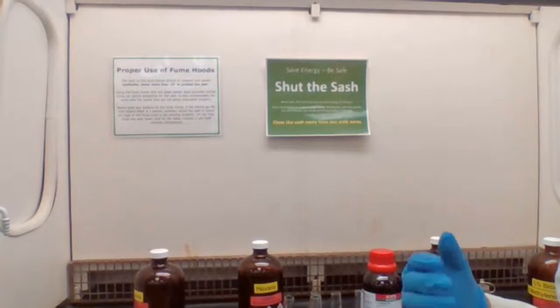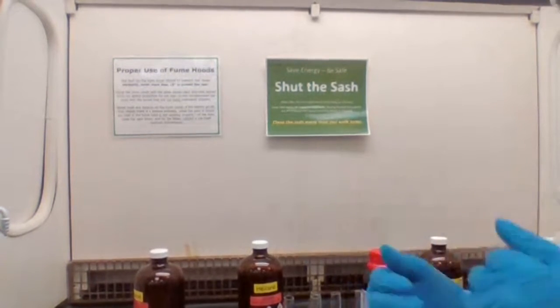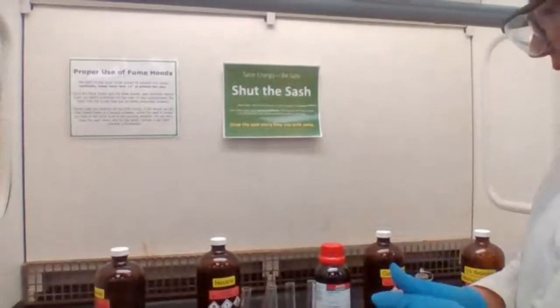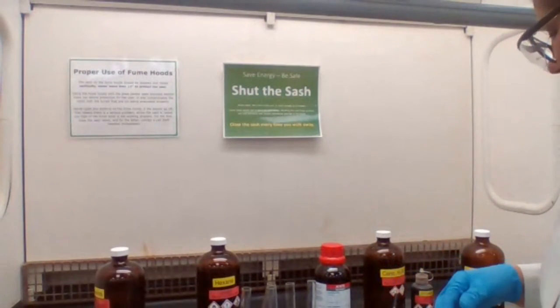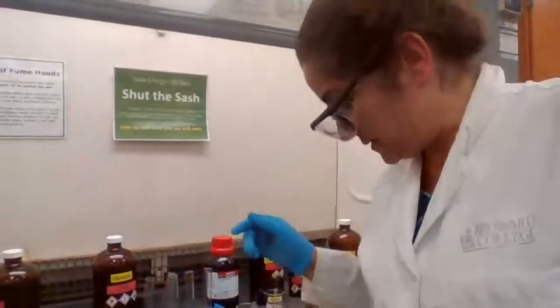Okay, bromine doesn't dissolve in the hydrocarbon. It reacts with hydrocarbon. That's just the proper term for it. Bromine is a reaction with the hydrocarbon, not a solubility. Okay, that's for part B, and we have to do one more experiment here.